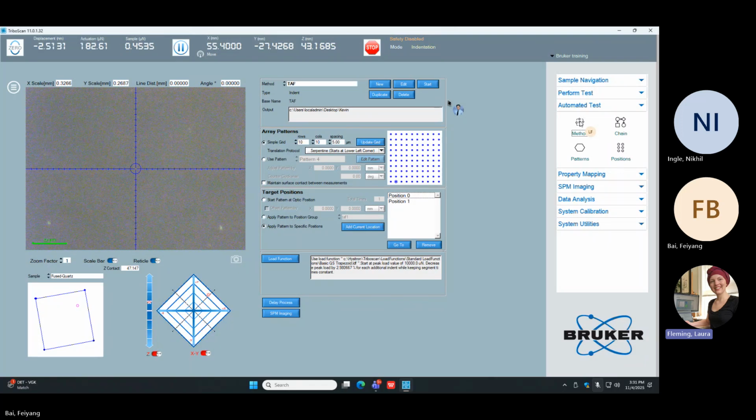Okay, so I think that covers just about everything on this screen, and it introduced us to load functions. At this point, it's a good point to pause training and run this method so that we can get a tip area function the next time we meet. We're ending a little bit earlier, but that's why I wanted the flexibility of the extra hour. It was more about getting to a flag point today than about taking up all the time. Unless there were any other questions, or anything we've covered that you want to cover again, or anything that's just not quite sitting right.